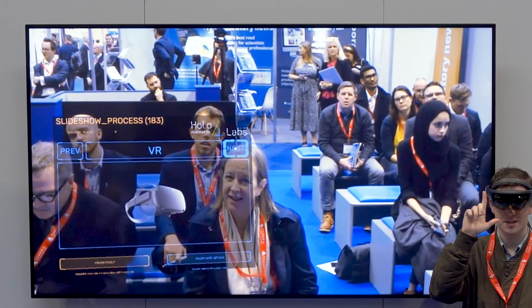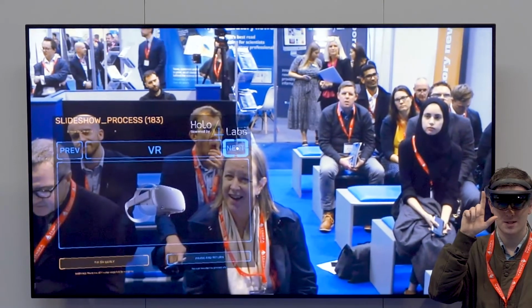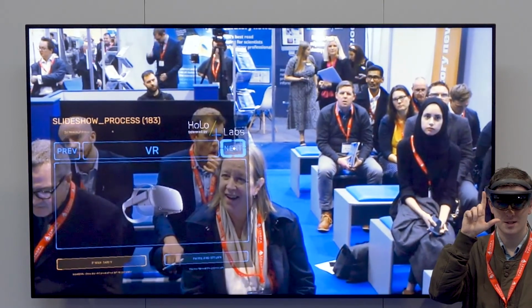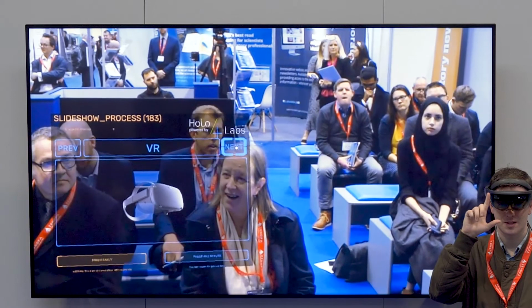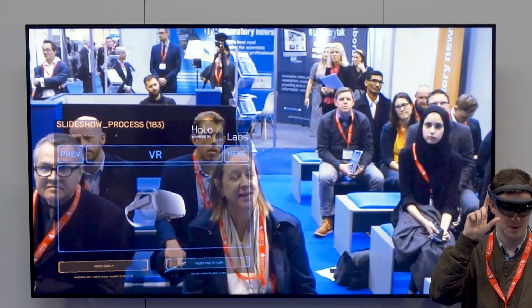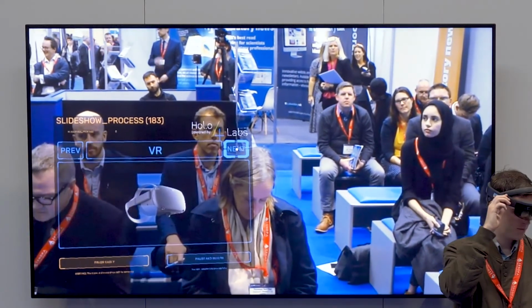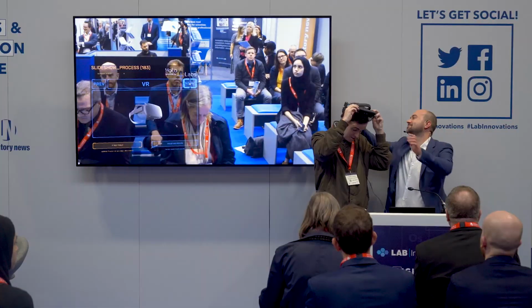But for every action, for example, all of those clicks, you can say select, and it also works. For our software, we have also prepared some special commands. For example, you can say scan sample, and then the sample will start to be scanned. Okay, thank you.